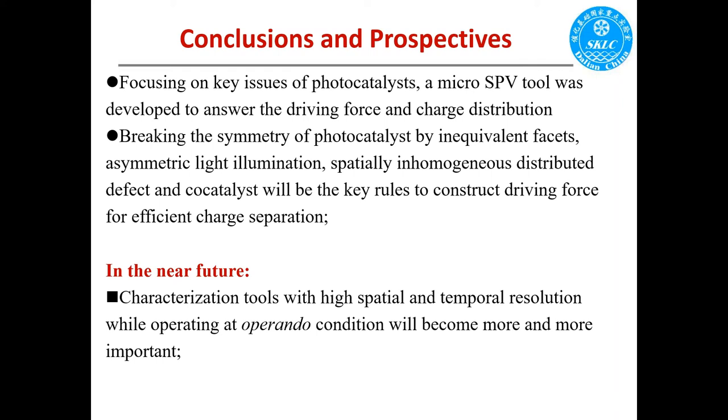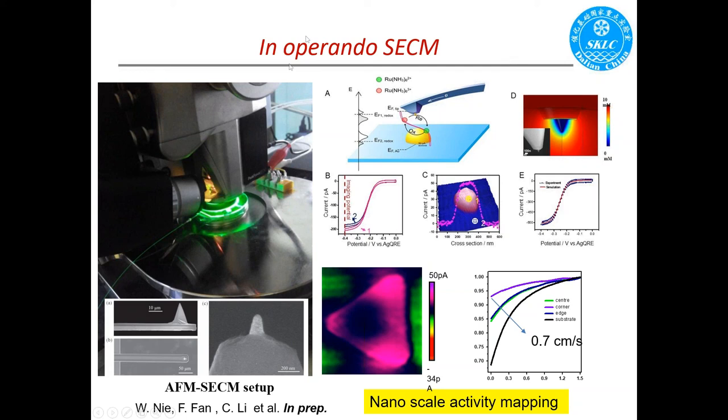But I have to mention that all of these measurements are at ambient pressure and with moisture atmospheres, and photocatalysis happens in electrolyte, sometimes in water. And we are trying to develop new tools. You may know from Dr. Huang's slide that Bruker recently developed the scanning electrochemical microscope, and this method is very powerful. We also took some time. You can see that with this technique, we can truly identify the chemical reaction site in the electrolyte. So this will become very powerful in the future.